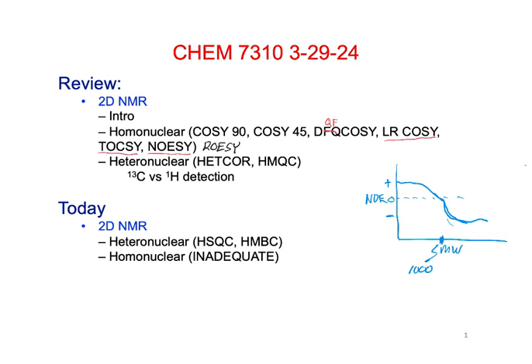But the ROESY experiment gets around this problem. So it's better for when we have a molecular weight around 1,000 or so. If you get up into that size, then the ROESY can be better. All right, and so we just looked at a few examples.